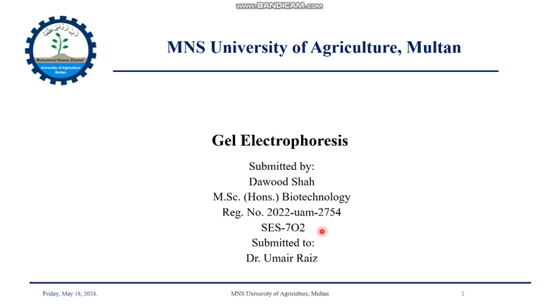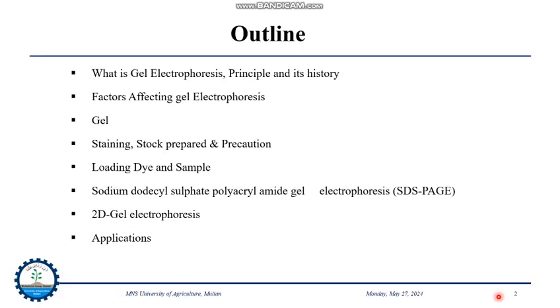So my presentation topic is gel electrophoresis. We talk about gel electrophoresis. The outline: what is gel electrophoresis, principle and factors affecting it, staining, gel loading dye, and the two types of gel electrophoresis and their applications.